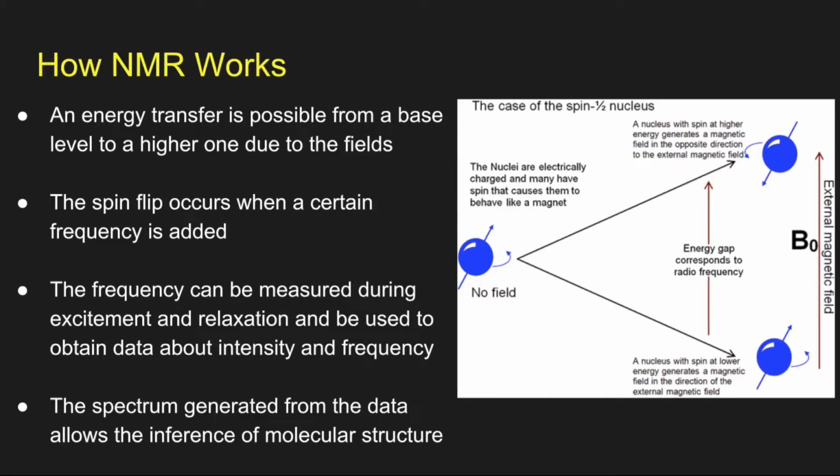So now, how exactly does nuclear magnetic resonance work? Firstly, since its foundation revolves around nuclear spin, we can use other topics of chemistry we learned in class to understand why nuclear spin plays such a huge role. To start, an external magnetic field is applied to the system. The magnetic field created by the spinning of charge resulting from nuclear spin will interact with the external magnetic field.